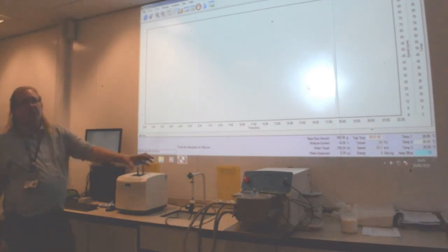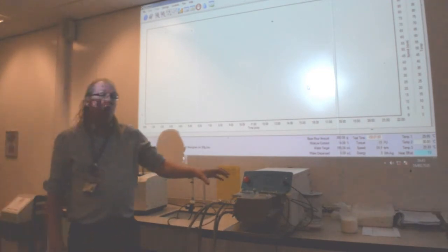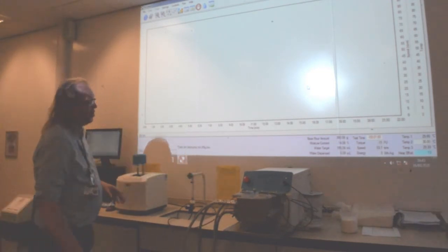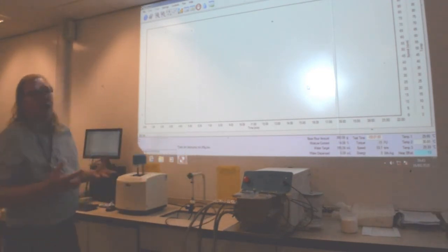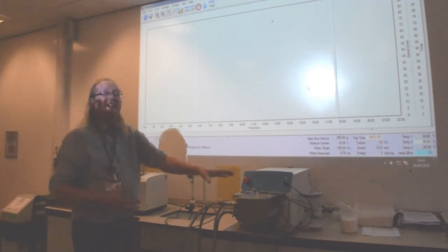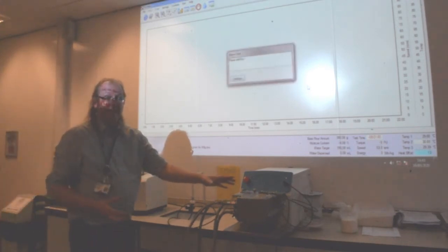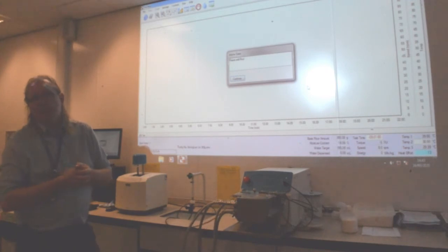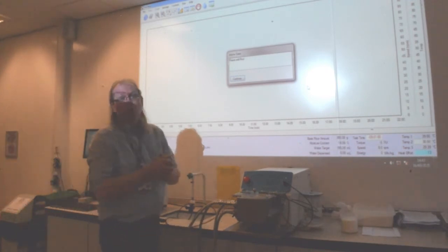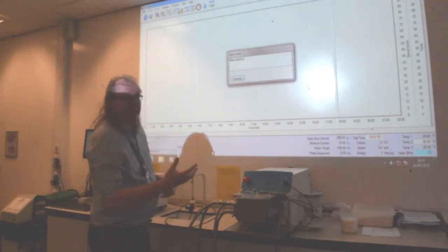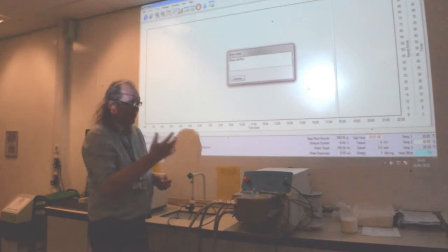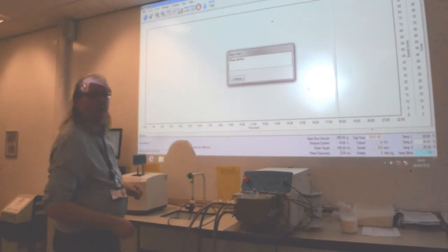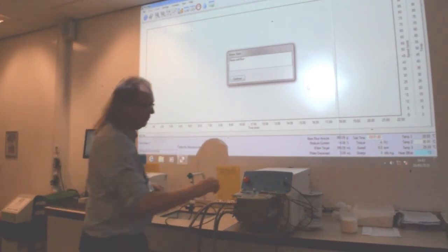The machine is then going to run. The machine has to work out, while it's empty, what the strain is on the motor. So it's going to run for a short while while it does that, and then it says add the flour.